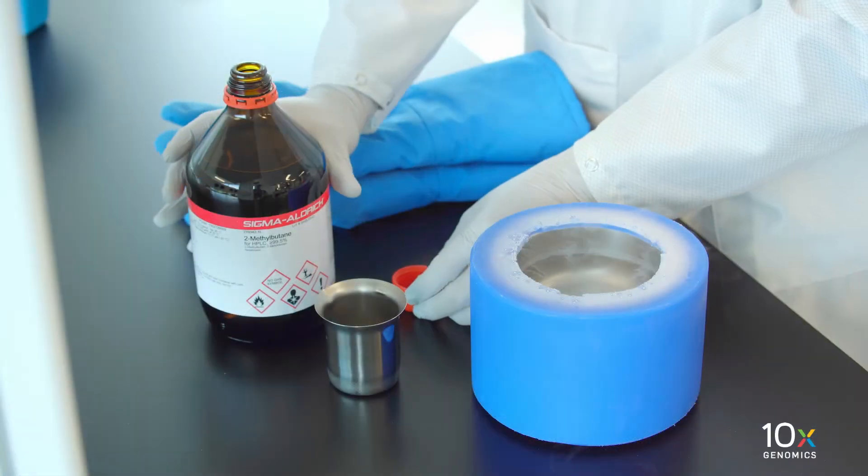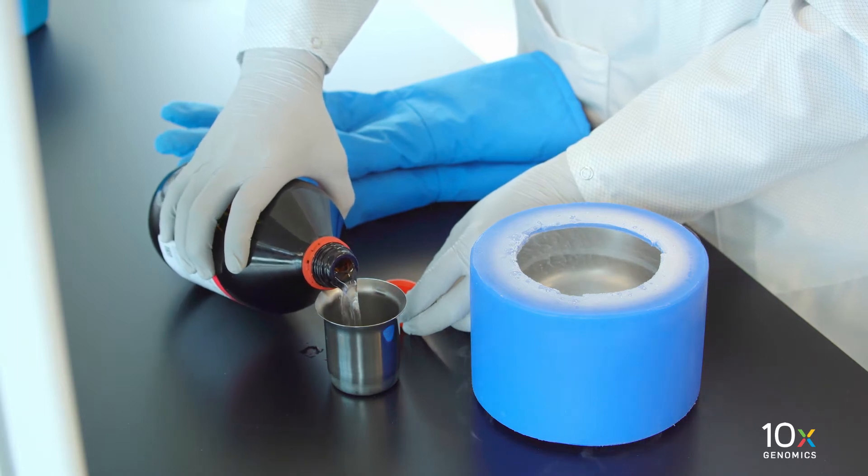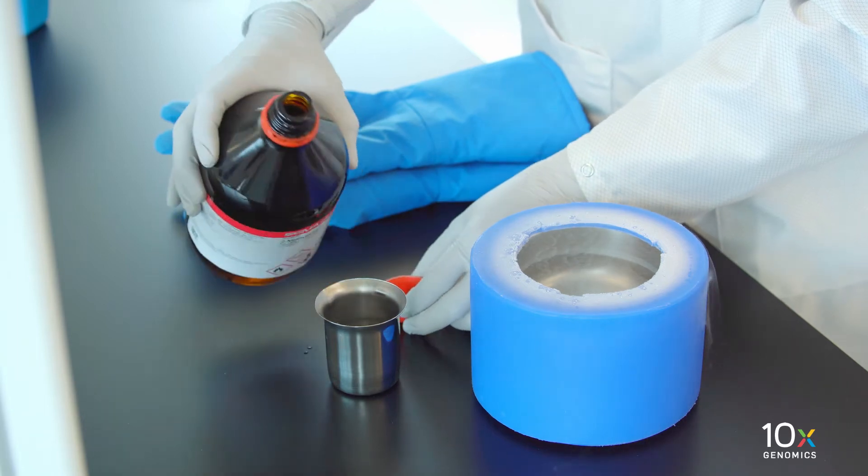First, we will prepare the isopentane and liquid nitrogen bath. Fill two-thirds of a metal beaker with isopentane. Make sure you add enough isopentane to fully submerge the tissue.